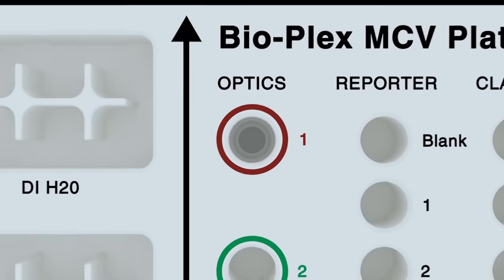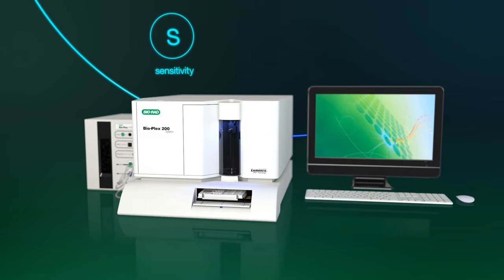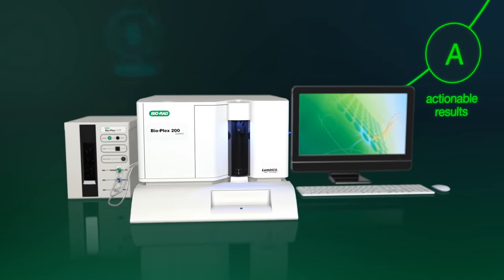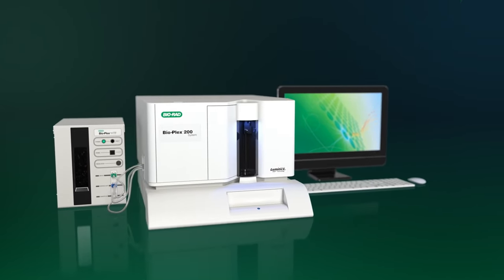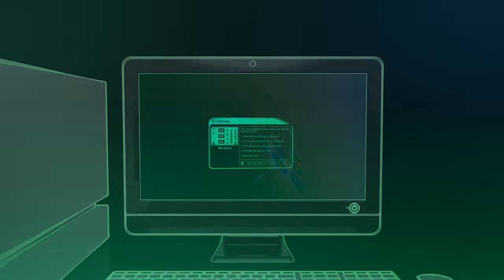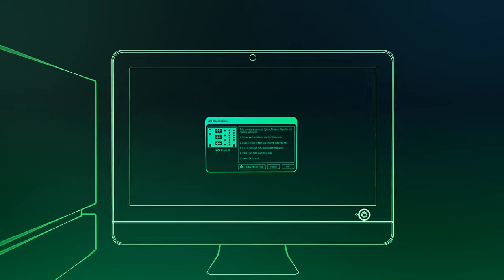Confidence in system performance is easy with the integration of the BioPlex 200 system, software and consumables. Let the software wizard guide you and know that you're on your way to a successful run.